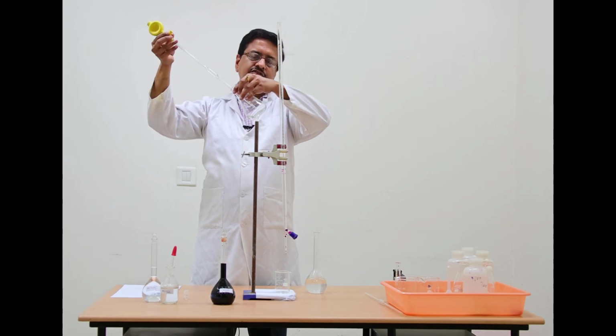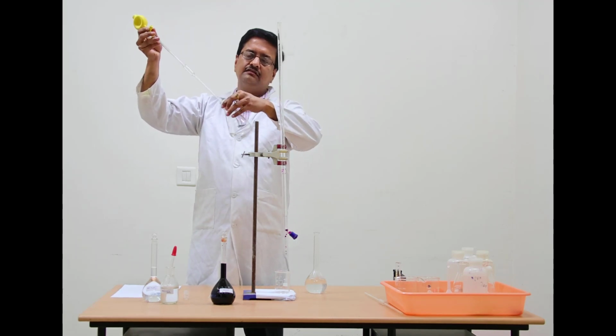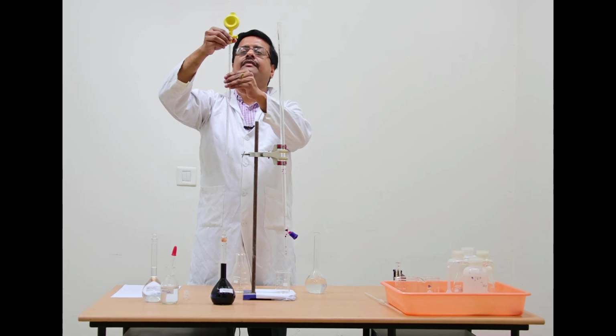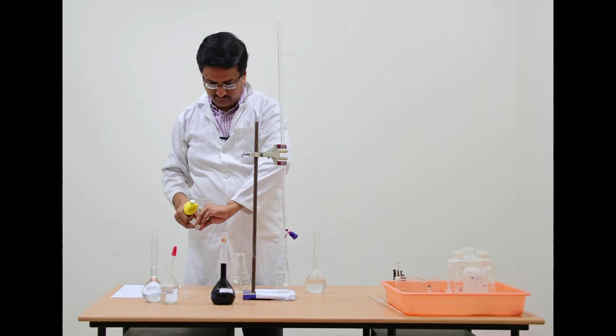The last drop we should just touch at the bottom to take it in. Whatever goes with the touching, it goes, and the remaining should stay back. There is very little oxalic acid staying back, and that amount should stay back in the pipette.